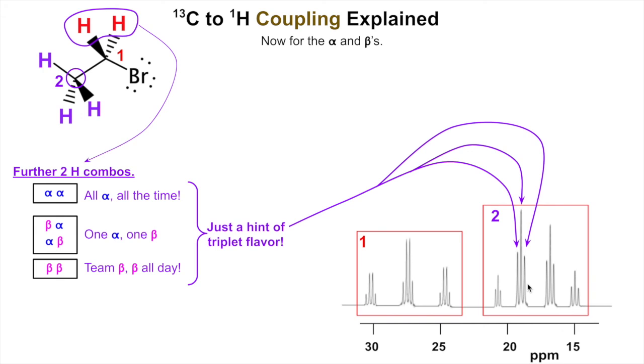And you got it. So that's why carbon-13 atoms are coupled by protons if we allow it. Next, I'll explain how we stop it from happening.